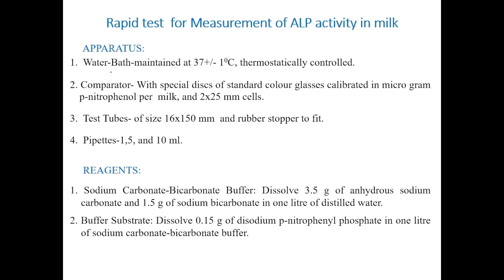So we require apparatus like a water bath, a Lovibond comparator, and test tubes, and the buffer used is sodium carbonate bicarbonate buffer. To prepare it, you dissolve 3.5 gram of anhydrous sodium carbonate and 1.5 gram of sodium bicarbonate in 1 liter of distilled water.